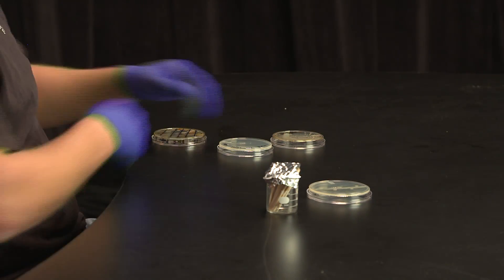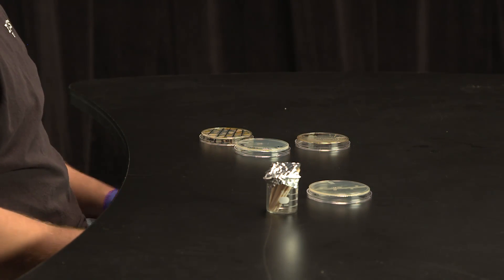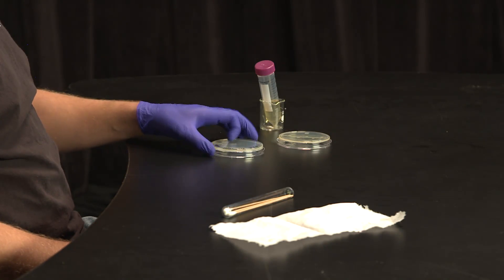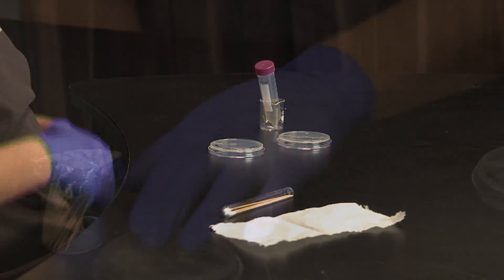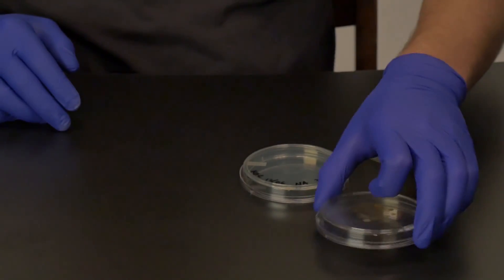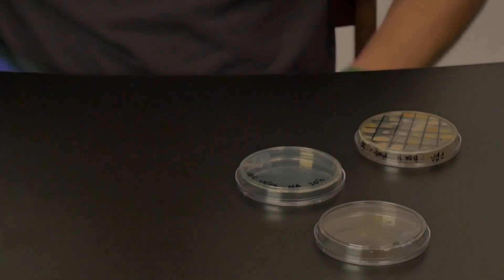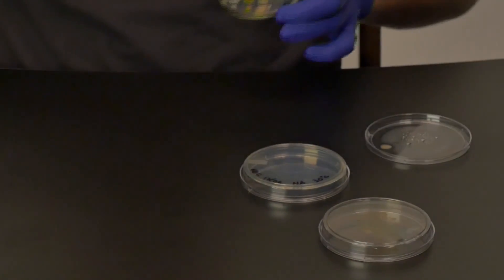This next method is named Turtle Tracks, due to the fact that it resembles the tracks that a sea turtle leaves on the sand. Obtain a sterile petri plate that contains the same media that you previously used to show a zone of inhibition. Take some sterile toothpicks, swabs, your master plate, and the positive control. Label your new plate with your name, the date, media type, and incubation temperature.